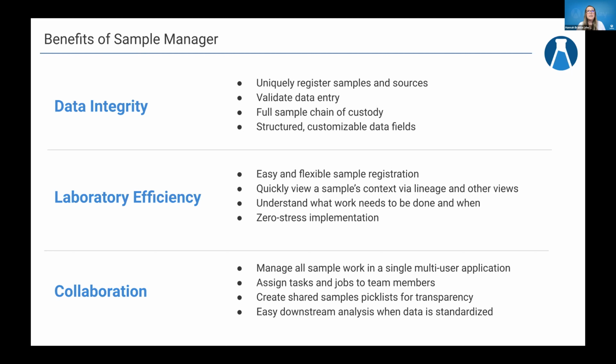Understanding what work needs to be done and when with our workflow tool. So we will provide you with the list of items that you've been tasked with, with their priority and due dates. And that allows you to know what you need to do when you come in for the day. And then hopefully you'll hear from our users later on. This is really meant to be a zero stress implementation tool. So we support you along the way, but we've also provided this great intuitive interface that hopefully allows people to get up and running very quickly.